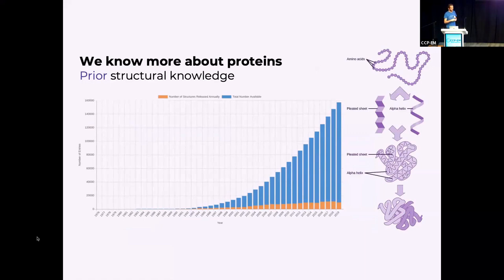Then the question becomes, how can I make a mathematical formula that incorporates that knowledge, and can I please also calculate derivatives or whatever I need to optimize that formula, so that I can have some sort of explicit target for my reconstruction? And that is no longer easy to just write down as mathematical formulas and solve.